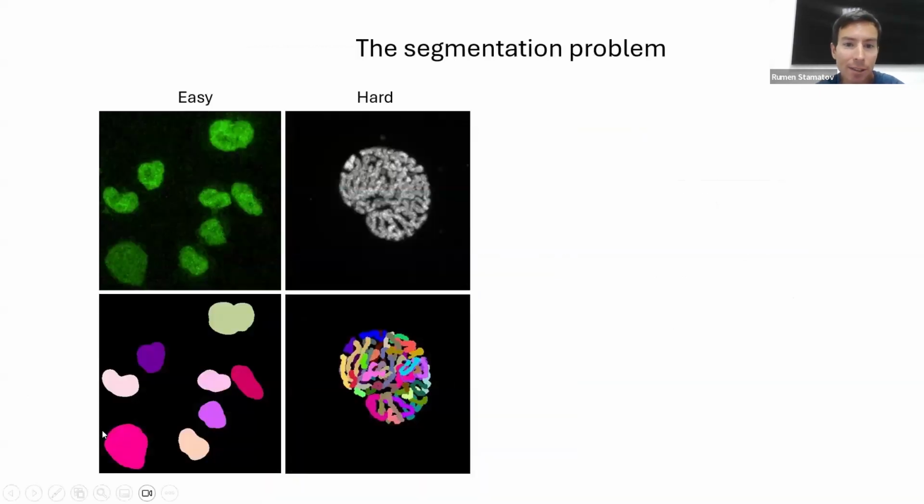Now, talking about segmentation, this is obviously a more difficult problem than usual, because what we're usually used to thinking about segmentation is just cells or nuclei, like we have on the left. And there are so many different tools already for segmentation of such so-called convex objects, which are round like a cell. But chromosomes, obviously, this is not the case for them because they have very twisted and complicated shape. So any standard method like watershed or even something more sophisticated like Cellpose or other neural networks usually fails.